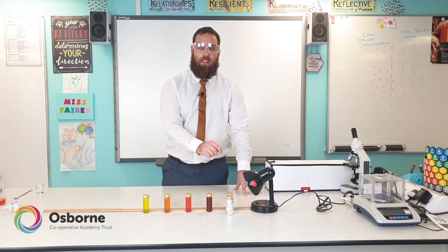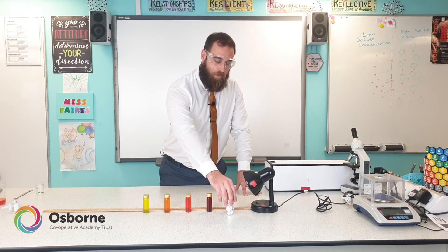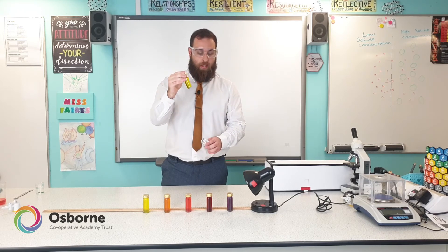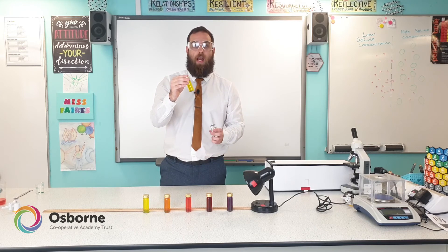To make sure it's light intensity that caused these changes, we look at the control. This bottle had no light at all, so no photosynthesis should have taken place — meaning there should be more carbon dioxide present and it should be more yellow. And as we can see it is very yellow, showing that photosynthesis hasn't taken place in the control, confirming that the changes in the other Bijou bottles are due to the lamp and light intensity.